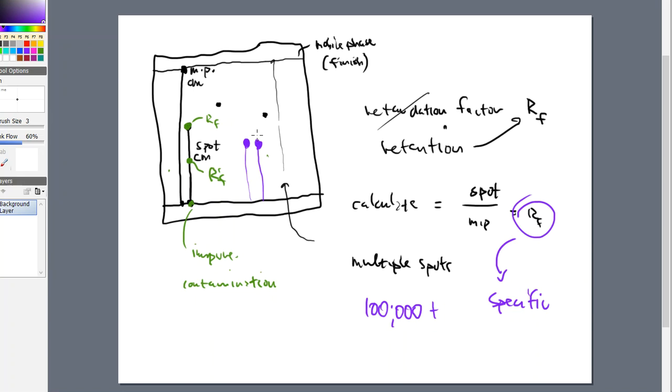So that was 25 minutes worth of background for you on what a plate is, what TLC stands for, what the stationary phase is, what the mobile phase is, and what kind of calculations we do with it, and now we know that's called an Rf factor.